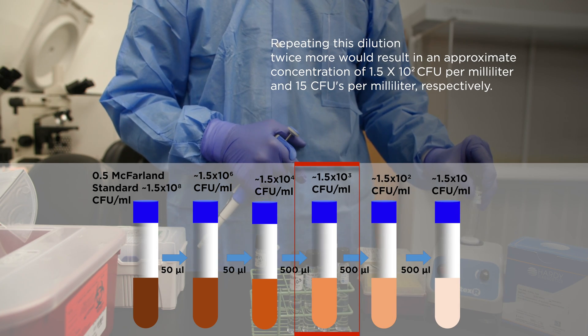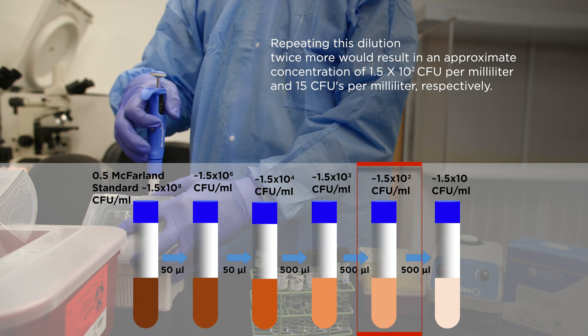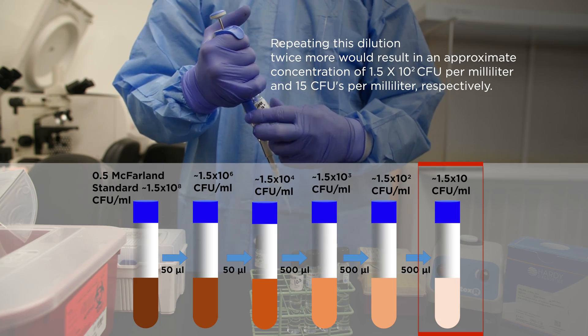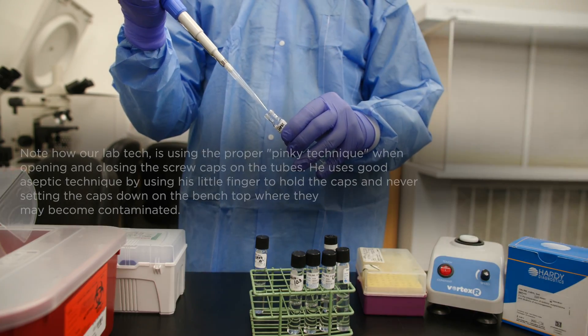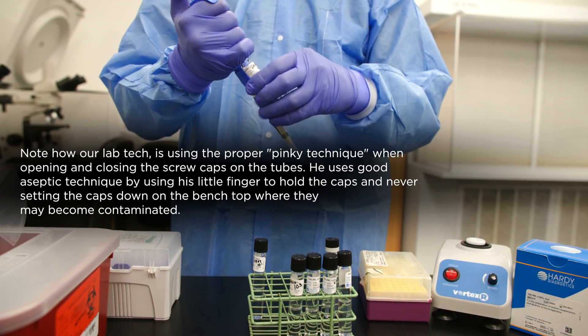Repeating this dilution twice more would result in an approximate concentration of 1.5 times 10 to the 2nd CFUs per milliliter and 15 CFUs per milliliter respectively. In this way, you can reach the desired bacterial concentrations using this dilution method.